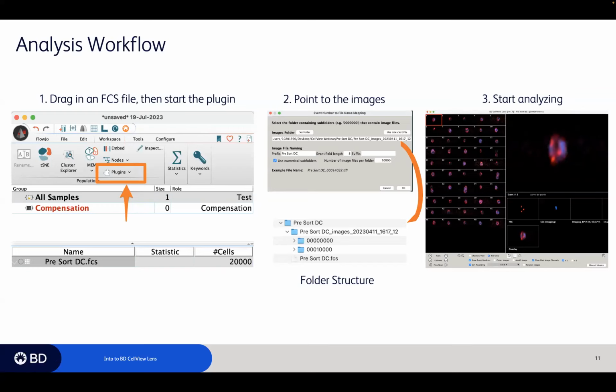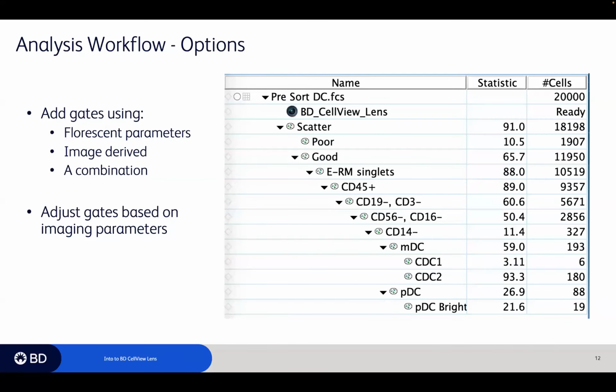So then how would you like to use those images in association with the FCS files? This is the part of the workflow that we now mention as all optional. There are a lot of ways you can go. How you want to proceed is completely up to you. So step one, I might suggest, there is some utility, of course, in adding whatever kind of manual gates you would like to do.